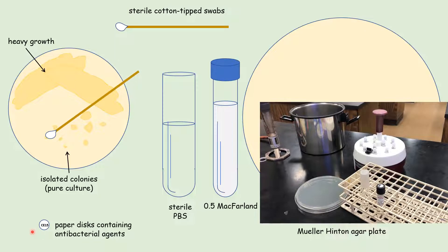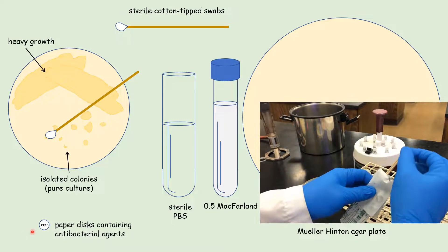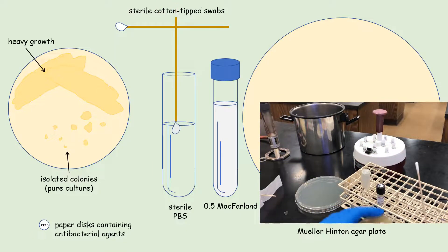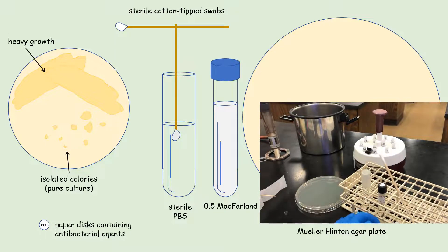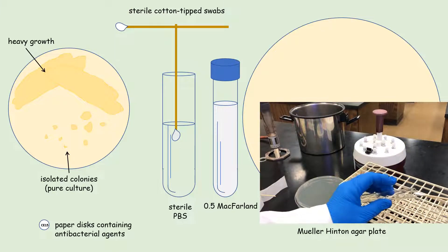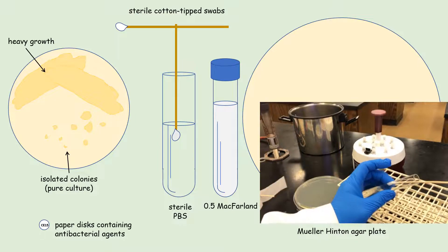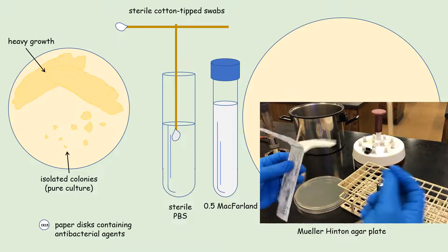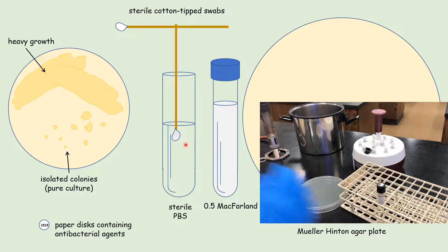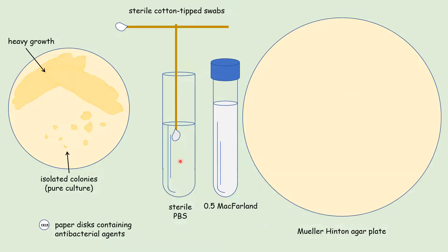We start by taking one of our sterile cotton tip swabs and picking up a few isolated colonies — one or two, depending on their size — and suspending them inside our sterile tube of phosphate buffered saline. We want to be careful not to suspend too much bacteria. We compare the cloudiness, or turbidity, of the bacterial suspension in the PBS tube with that of the 0.5 McFarland tube. We want to match them so that we have roughly 1.5 times 10 to the eighth bacterial cells per mL.